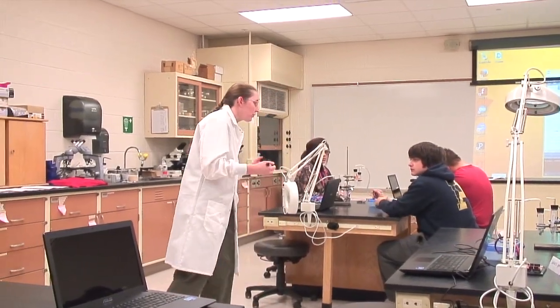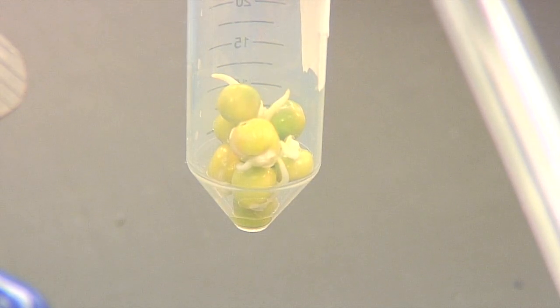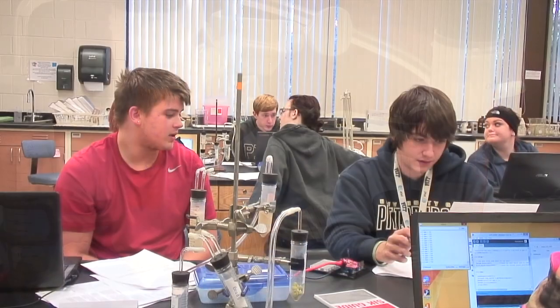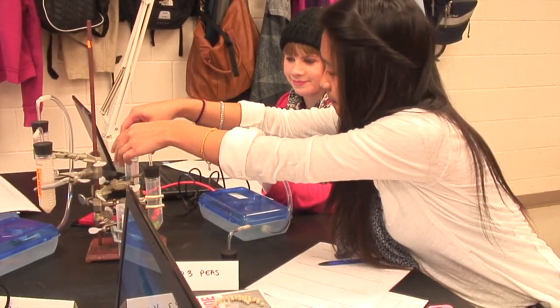When the students arrive in the classroom, they're given a basic introduction about respiration. Once we introduce the students to the carbon dioxide sensor, part of the class begins the pea experiment and the other part of the class begins the yeast experiment. So at each table we have a setup where students are sensing CO2 from yeast and CO2 from pea respiration. This is our final setup, what it looks like.